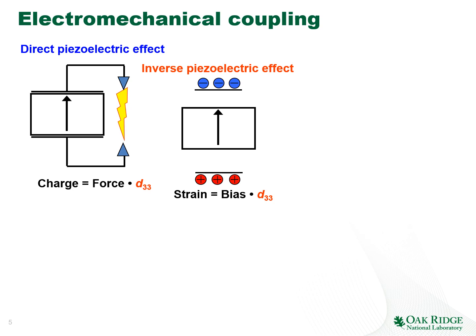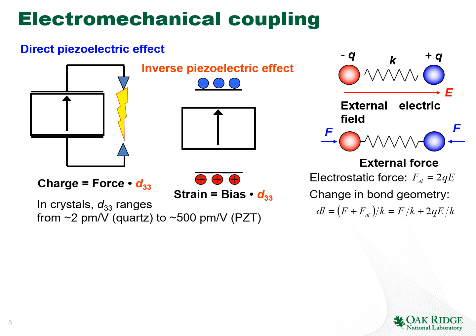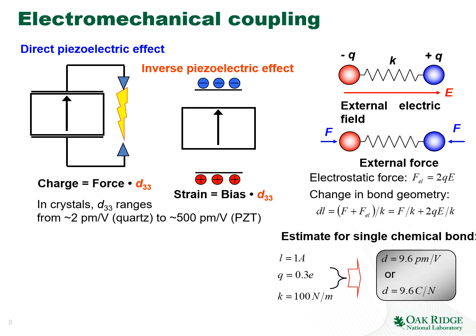So let's go all the way to the very small length scale in the case of a single chemical bond and see what is the magnitude of the piezoelectric effect at the single bond level. In this case, it is really easy to analyze. If we take the single molecule, put it in the electric field, it is very easy to calculate the effective piezoelectric effect from the charges and the force constant of the bond.